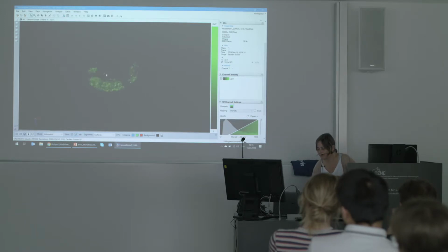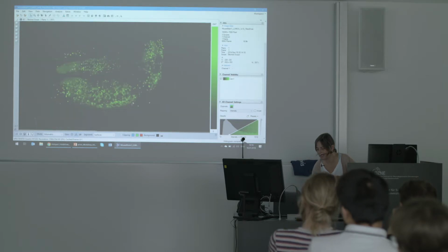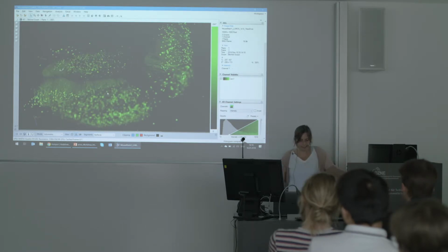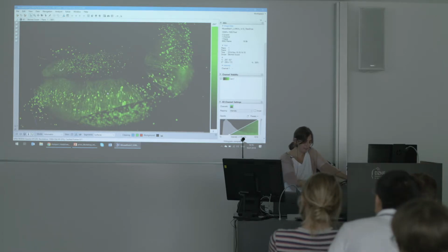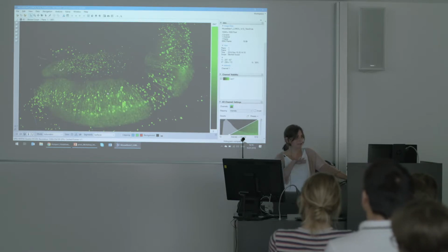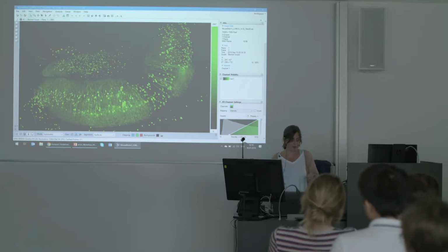And you can see it's already loading the data, tile by tile right now. But at the end, my setup is absolutely not optimal, because I'm using an external drive. Everyone here with experience would always say never do that. And you would not work on a notebook in your daily life, but I can work with this data, and this data set itself is 800 gigabytes in size. So usually this is impossible on a notebook like this.